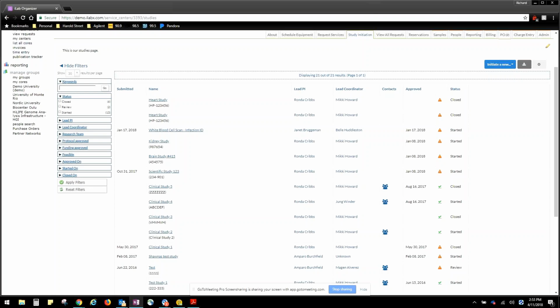Yeah, Audrey, if you're on the call, I want to say those are defaulted. I'm not 100% sure. I don't think it is quite yet, but I think it's something that may be. I don't know if Audrey, if you're still on here, can weigh in there. Those are unfortunately hard-coded in. I'm not sure if they are looking at making those a little bit more configurable for version 2 of studies.